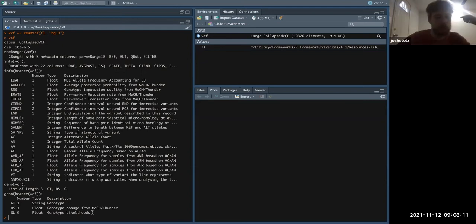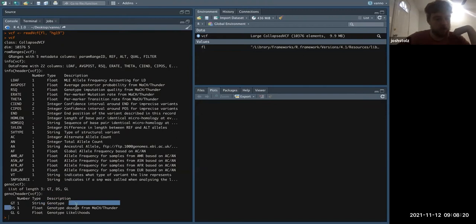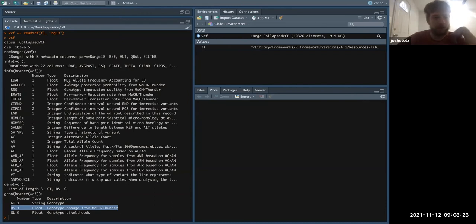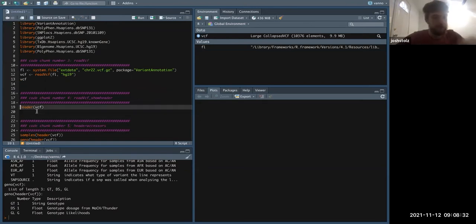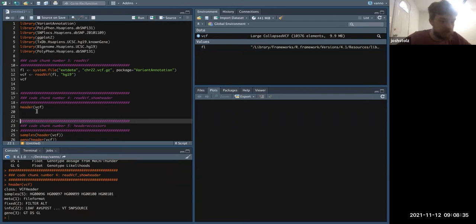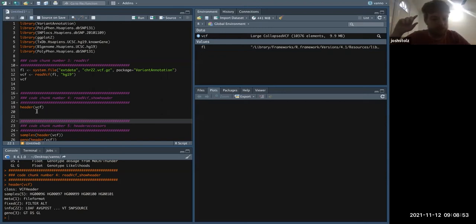In the case of ours, our data is almost all dosage at LIBR because most of it's imputed. We can look at the header of a VCF — every VCF has starter lines. Our headers at LIBR also have almost like a track record history of every time BCFtools is run.